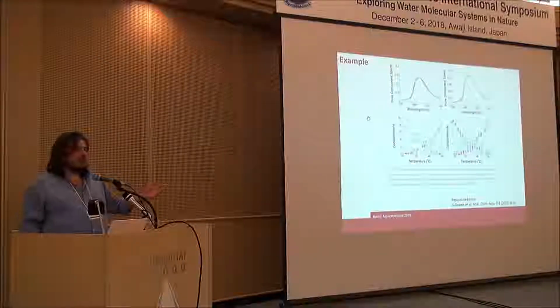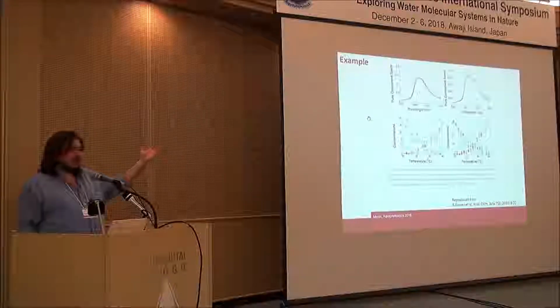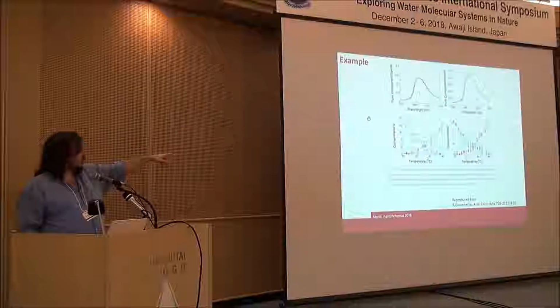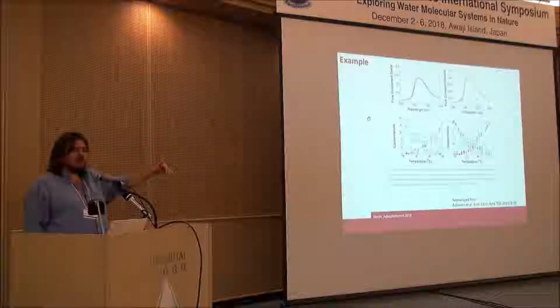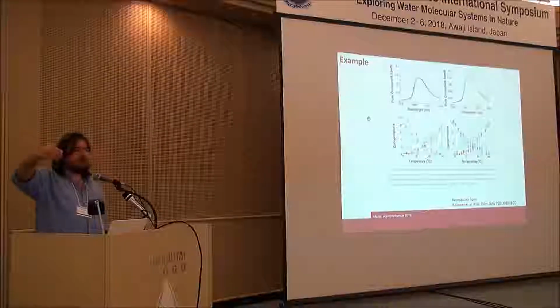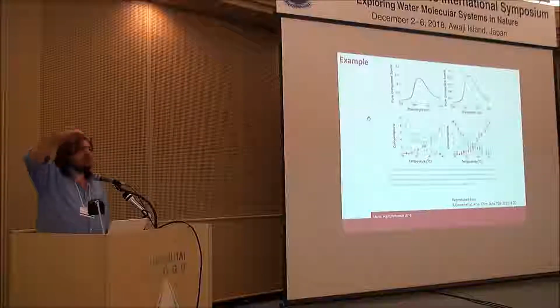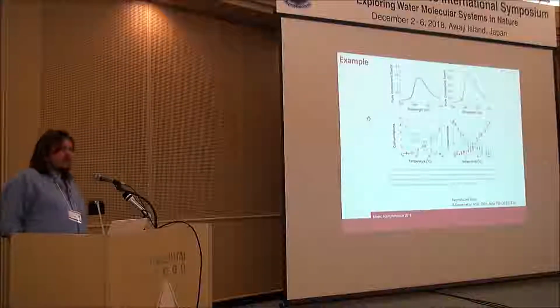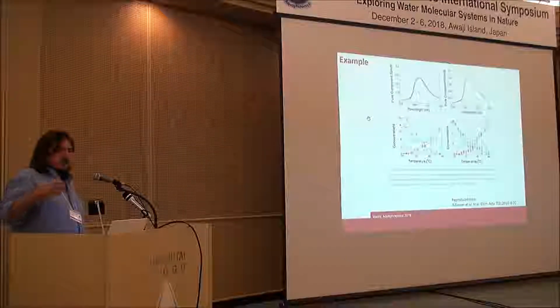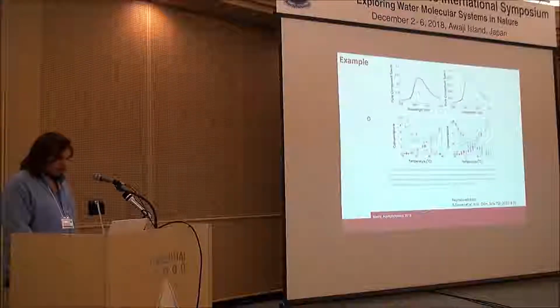In this case, data were analyzed with MCR, showing 3 different spectral characteristics with profiles that were evolving according to the shape that you see in the lower part, the score part, giving the idea of a process that with increasing temperature is proceeding, passing to an intermediate shape and then going to another structure. So with 3 structures in equilibrium, the equilibrium concentration changes with changing temperature.